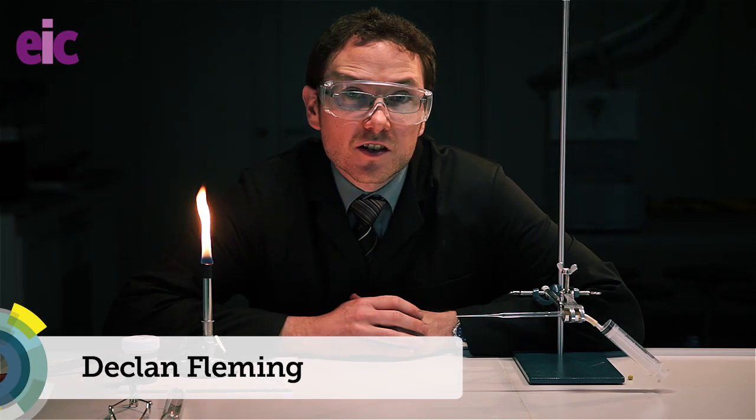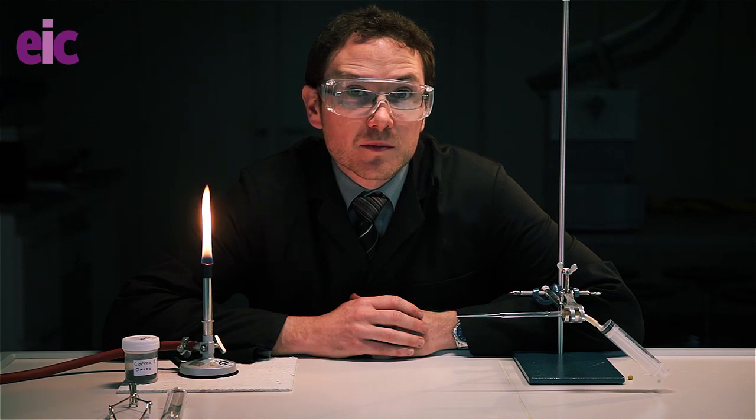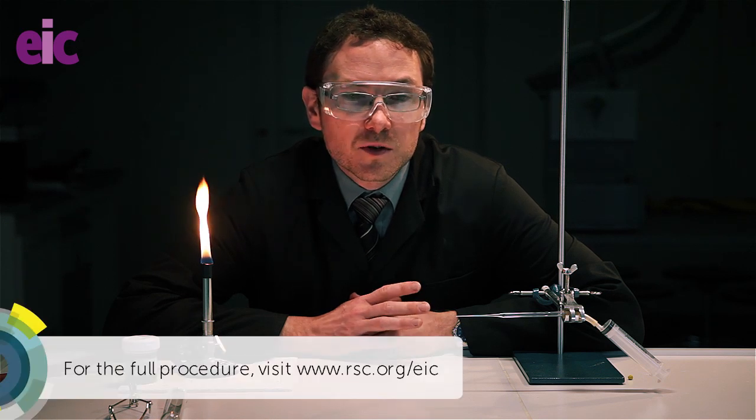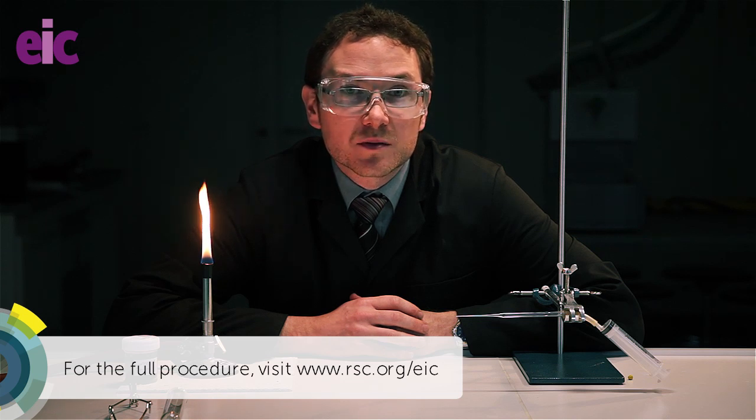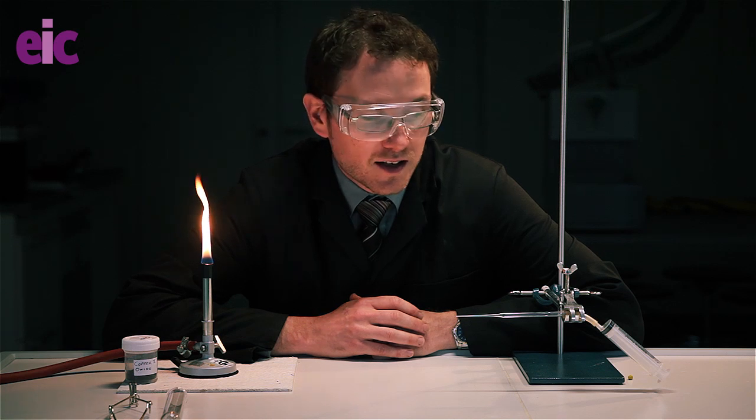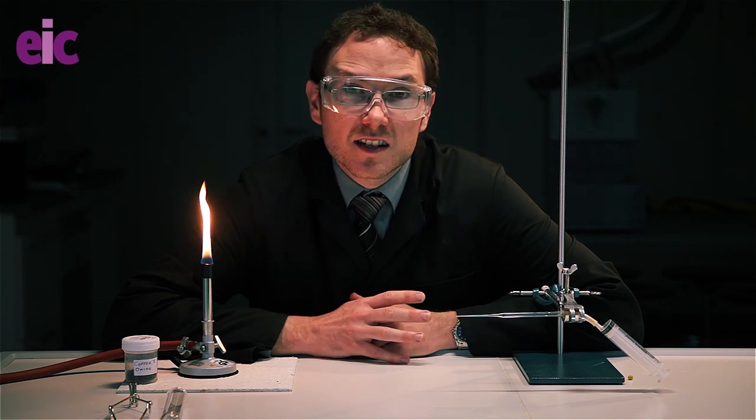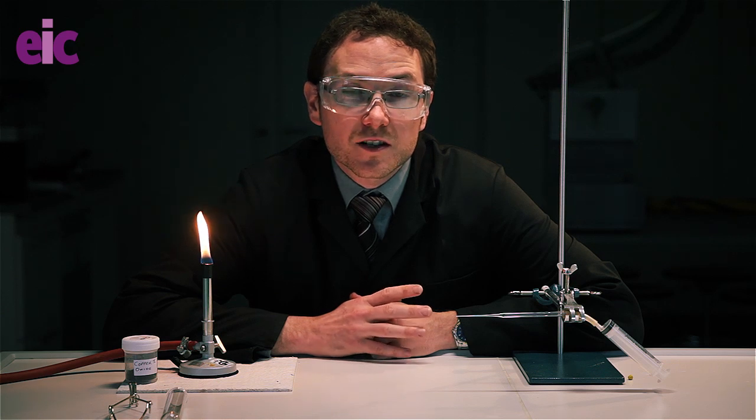So this month we're going to be having a look at the reduction of copper oxide. This is a practical that a lot of students will do with carbon. One of the problems with that is you've got all this black carbon powder making it difficult for them to see the product. If you do it with hydrogen instead, you also have the advantage of being able to see the oxidation product, the water.